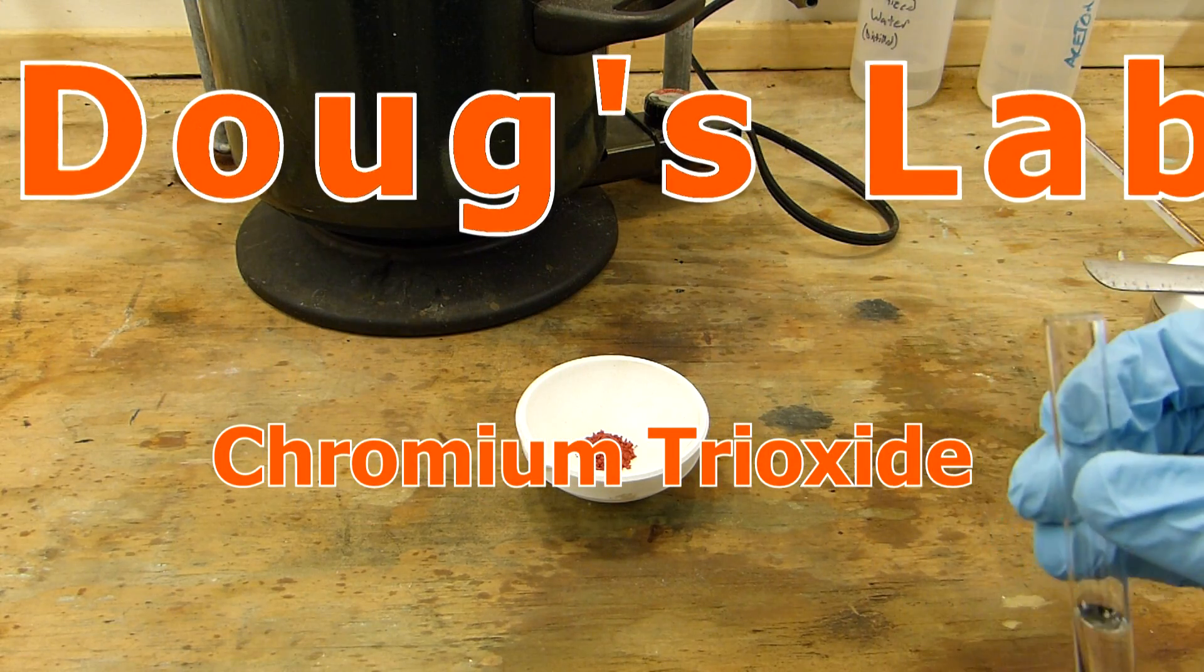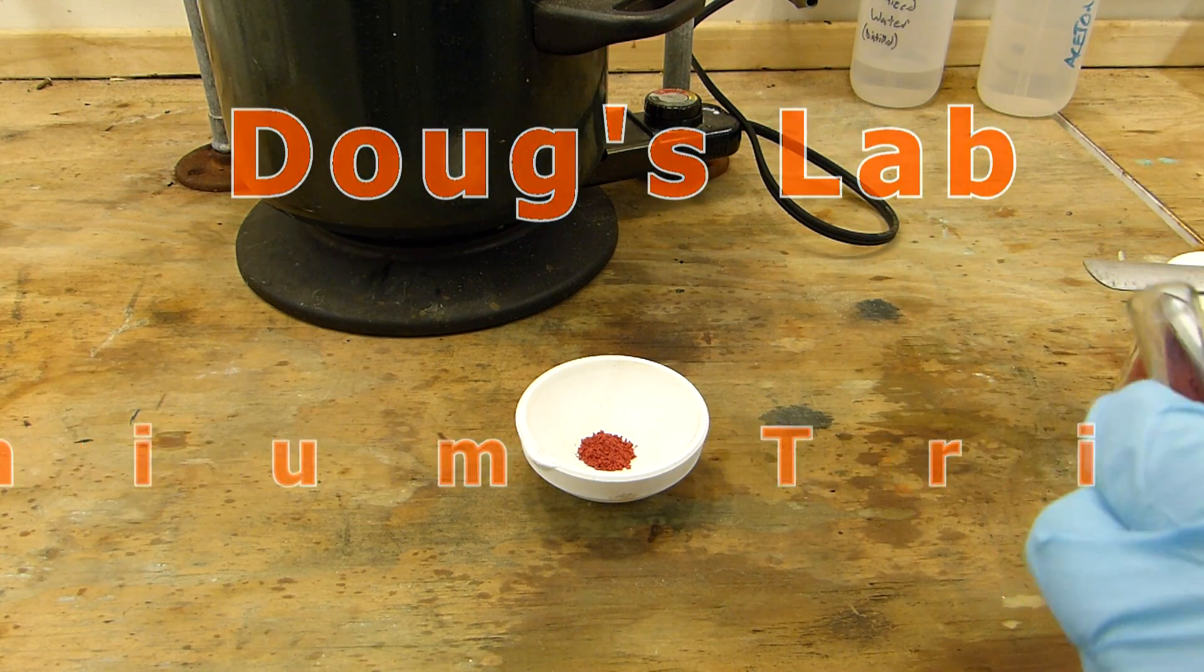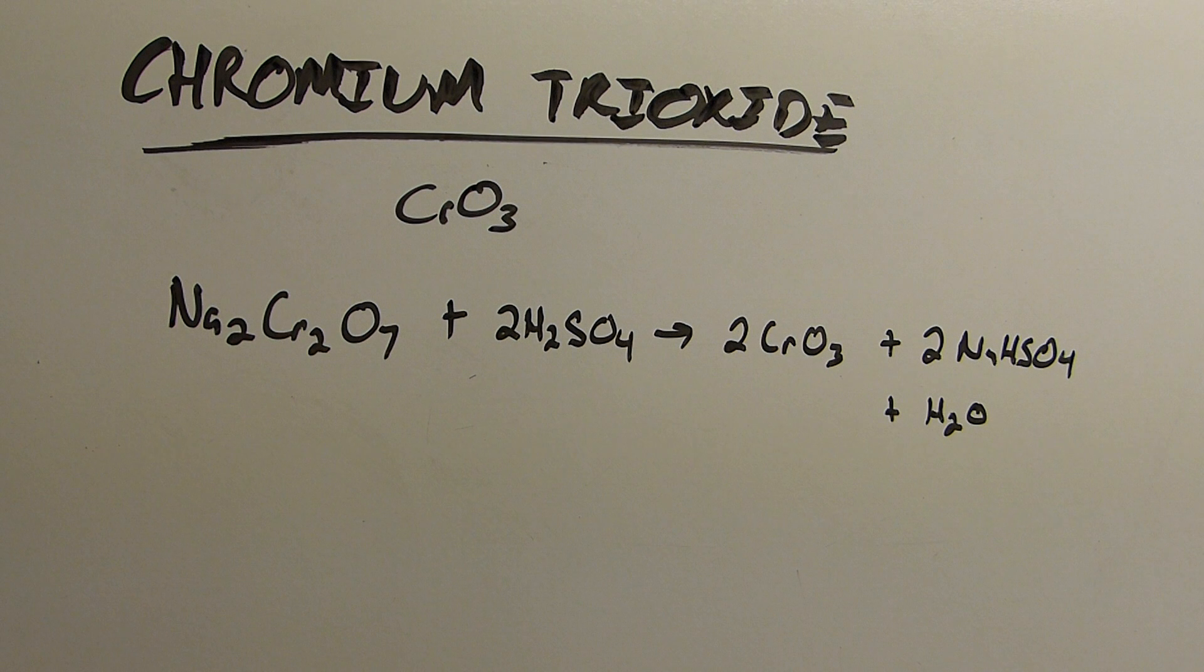I'm going to pour methanol onto the chromium trioxide and we'll see what happens. Hi everyone and welcome back to the lab.